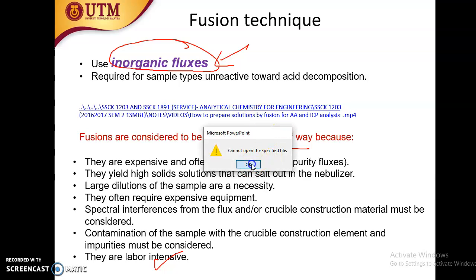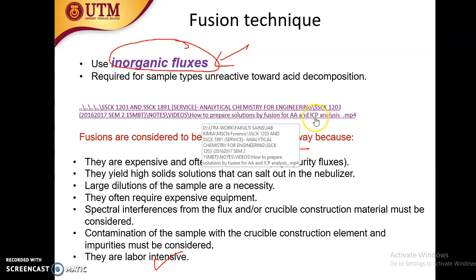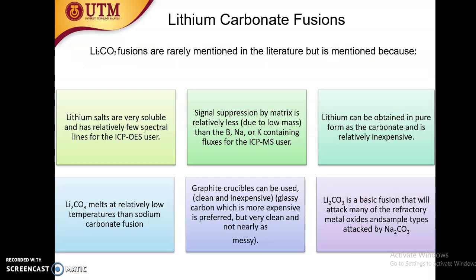I cannot open it. I don't have the video, but never mind, you can find it on YouTube. You can find how to prepare solution by fusion for AA and ICP analysis. This is an example of lithium carbonate fusion. You can read on your own.